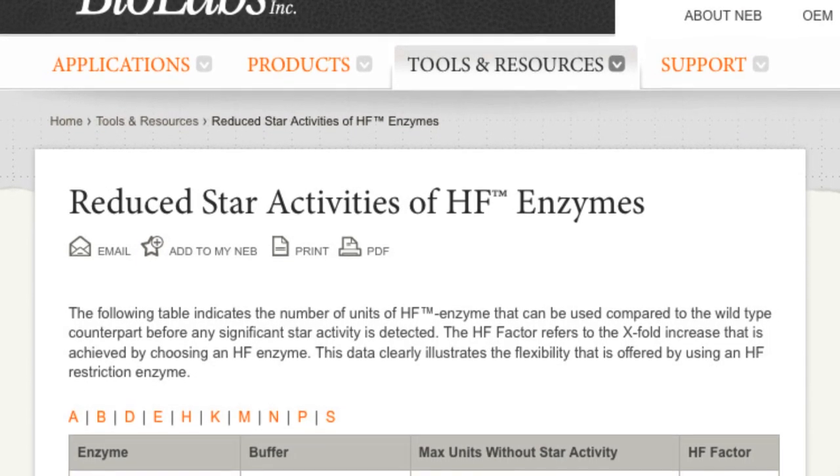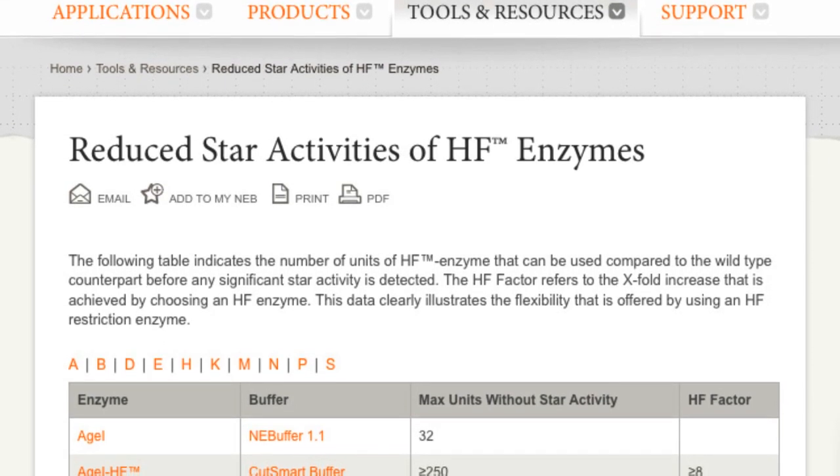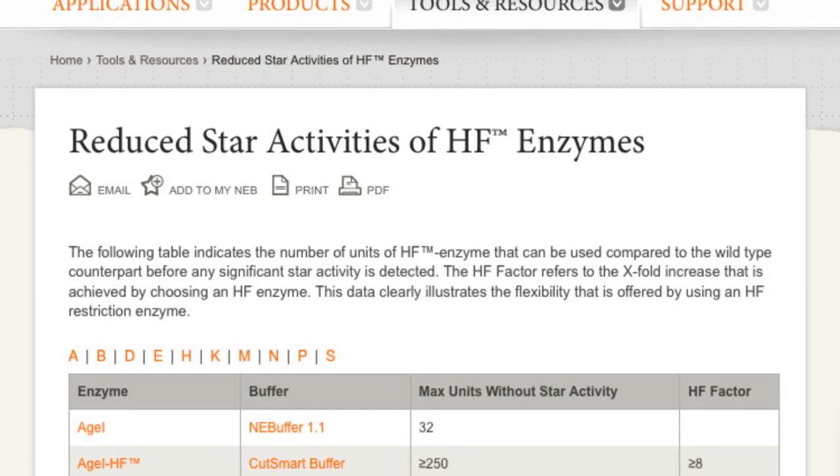For example, HindIII HF will give the same specific cutting pattern even if you use up to 2,000-fold more enzyme compared to the wild type.